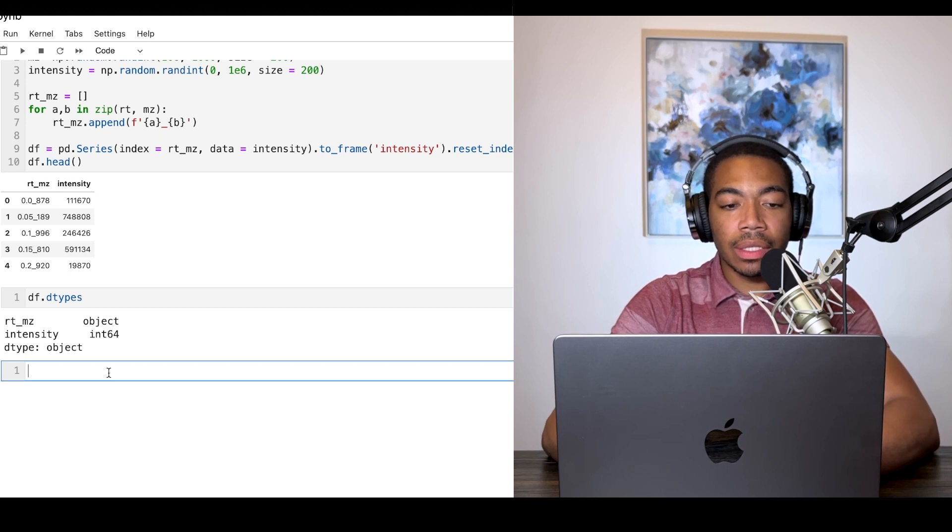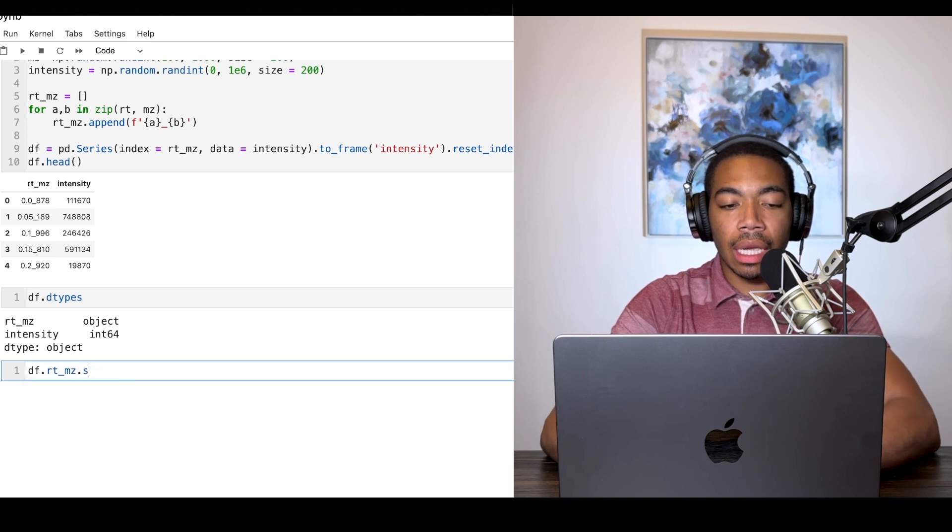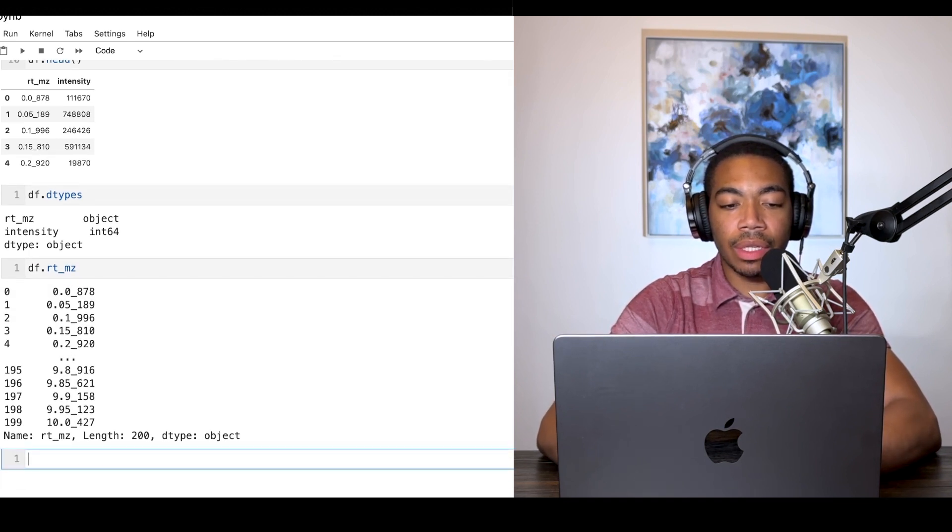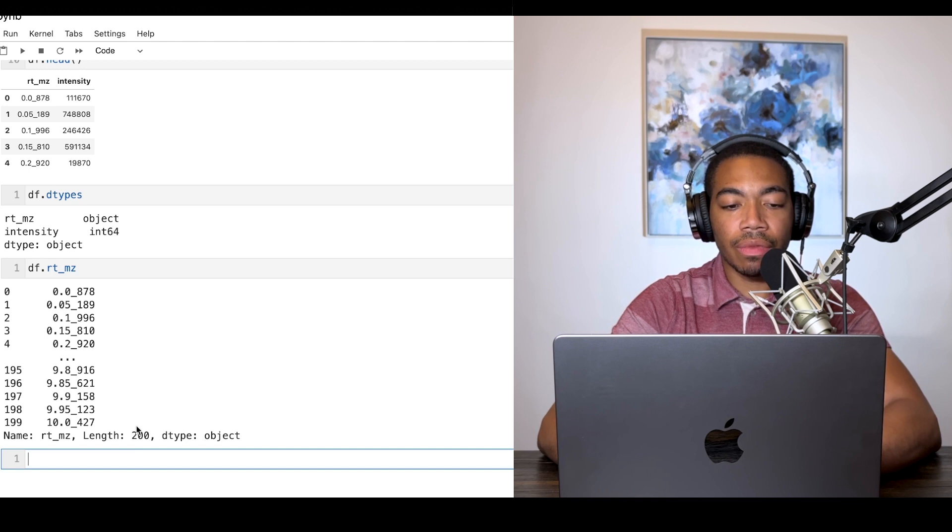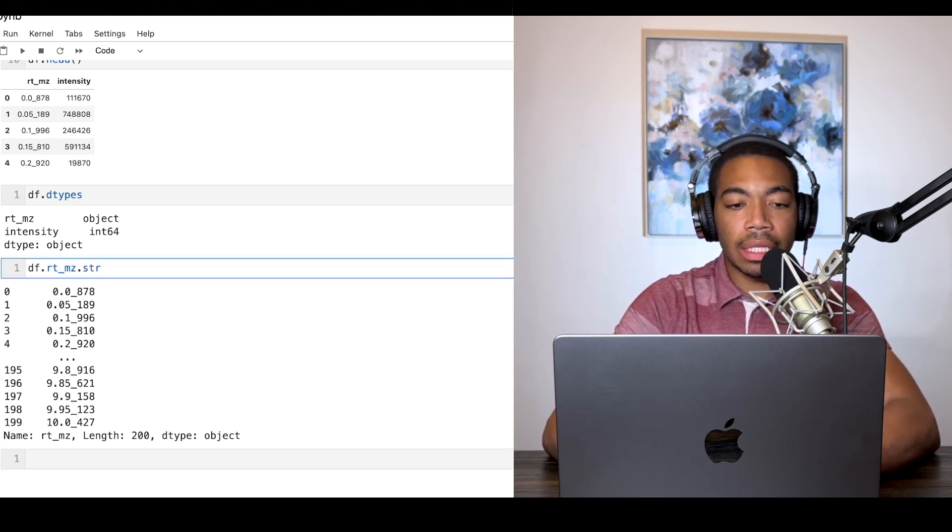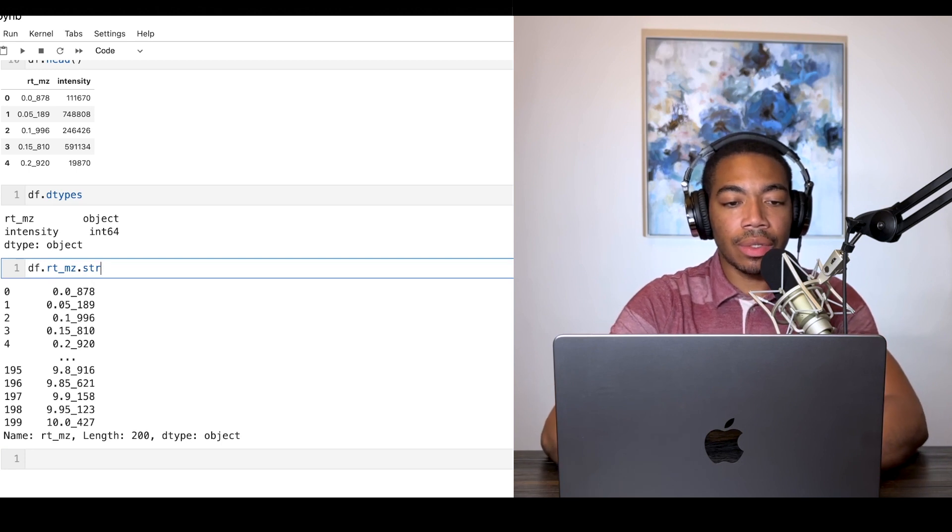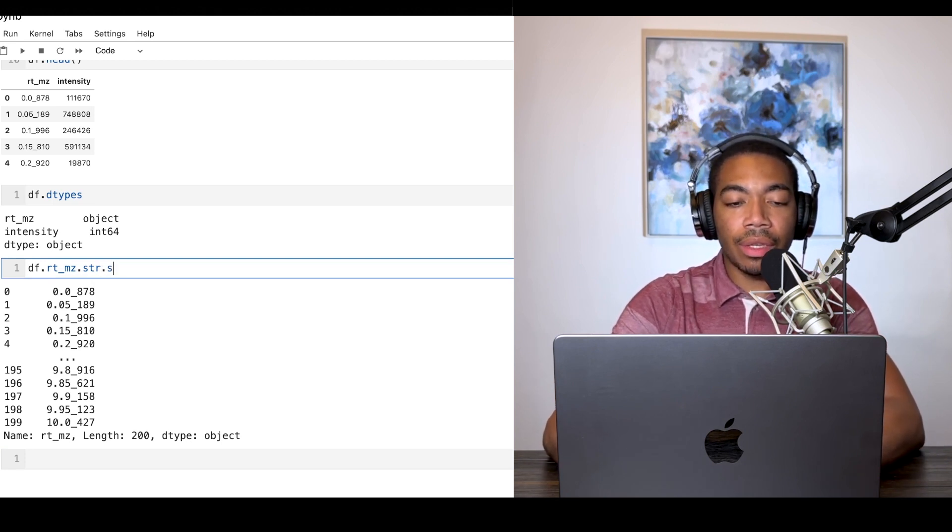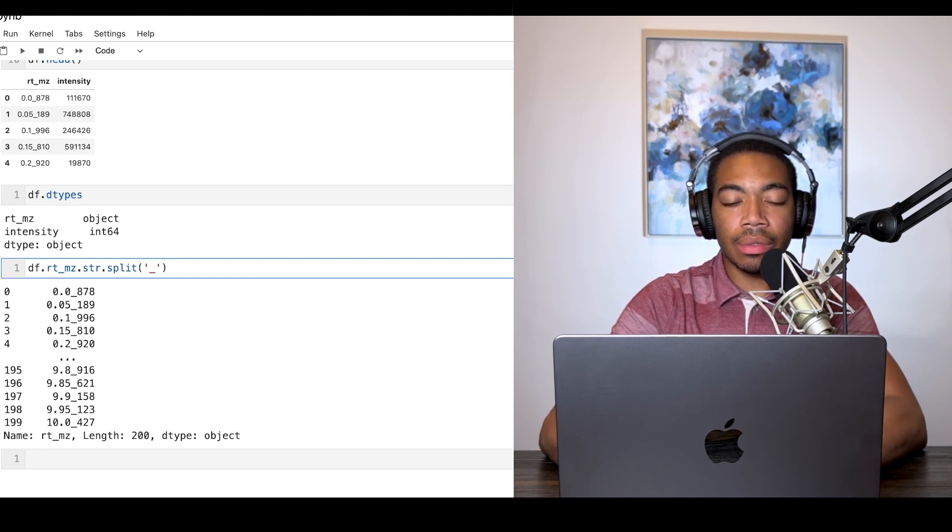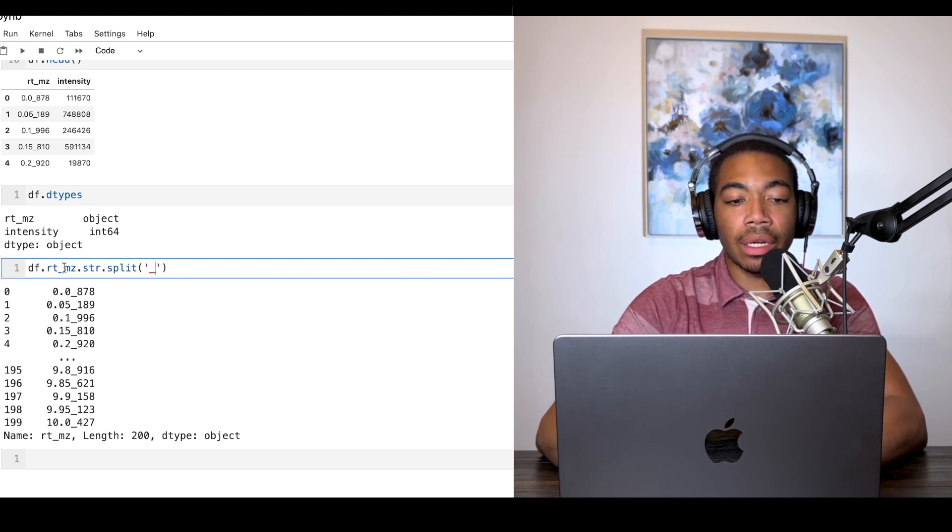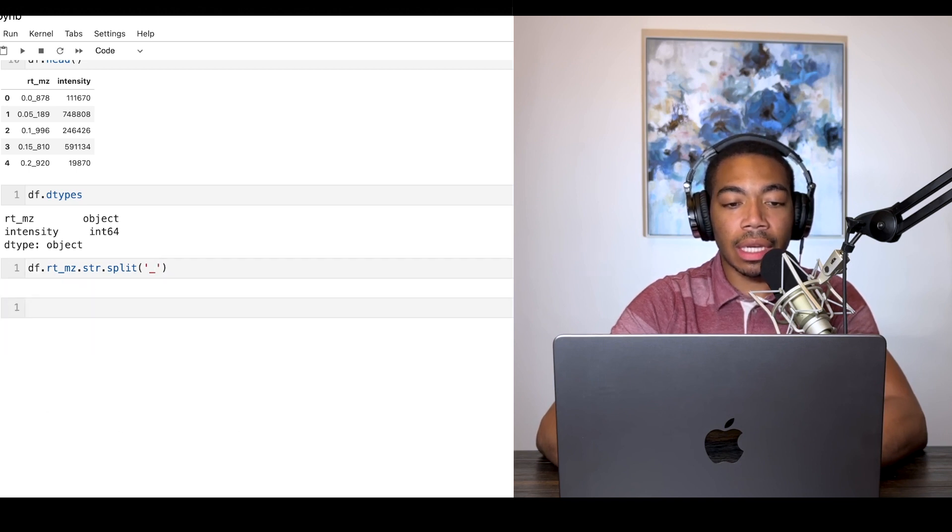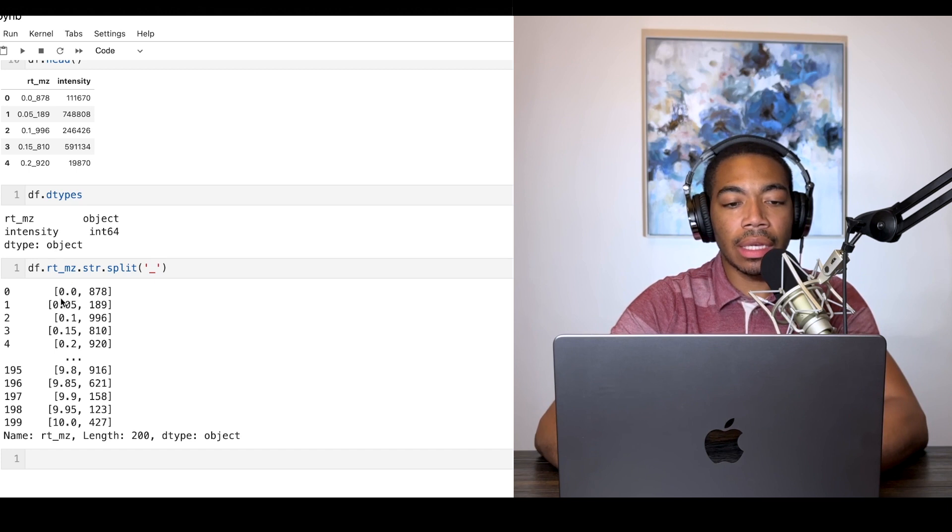We can simply call this column rt_mz. You can see we have this object data type and there are 200 variables. Let's begin splitting. The first thing you want to do is use the string accessor using str, and then we can use the split method and tell this method to split on the underscore. This is where we have our retention time stored on the left side and the mass-to-charge stored on the right side.